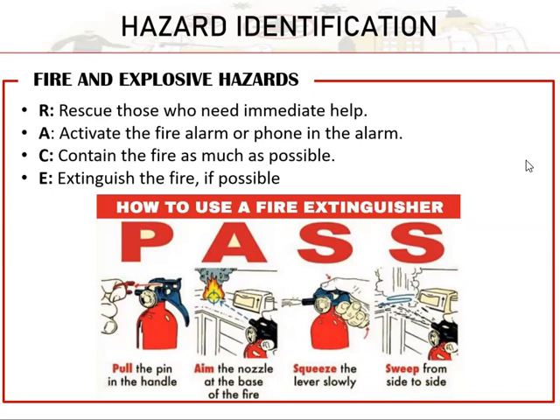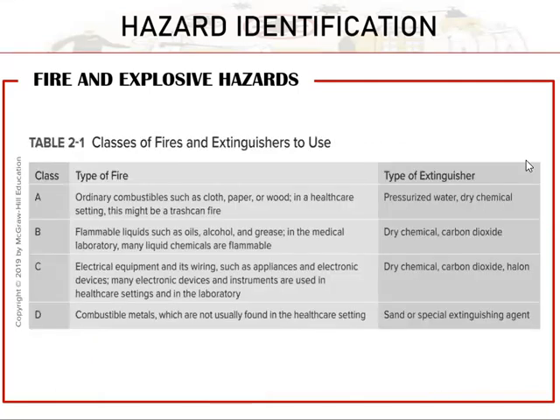So we must remember this one, na dapat presence of mind yun in case of emergencies. Even though memorize nato ning RACE, memorize nato ning PASS, pero pag abot sa emergency, dili gyud maiwasan na magpanic. So, makalimtan na gyud ang tanan. So, just have that as an opportunity to help. Since you are knowledgeable na on what to do, in case of emergency, naa mo'y contribute that will help the community. And then we have here the classes of fires and extinguishers to use.